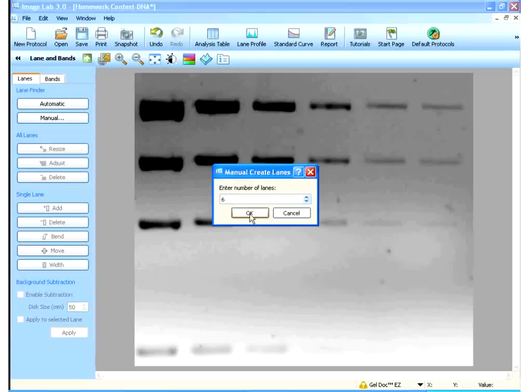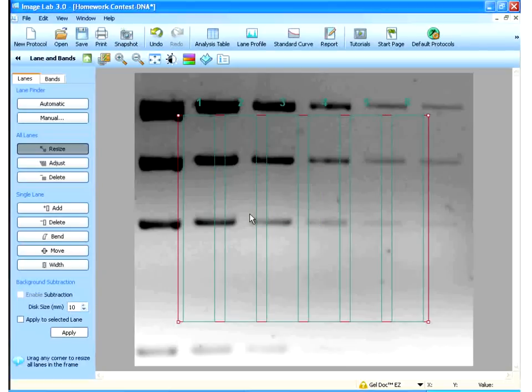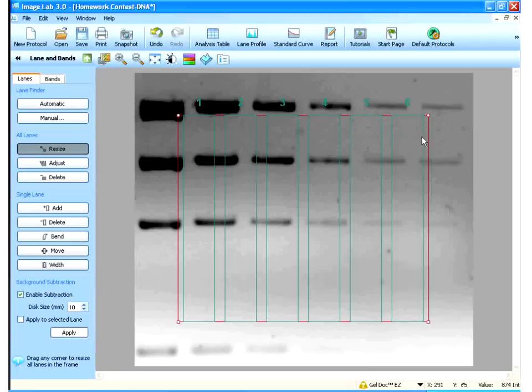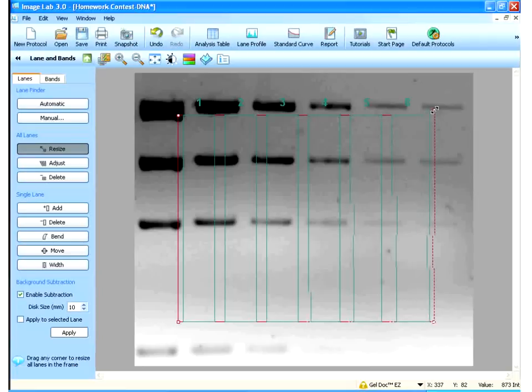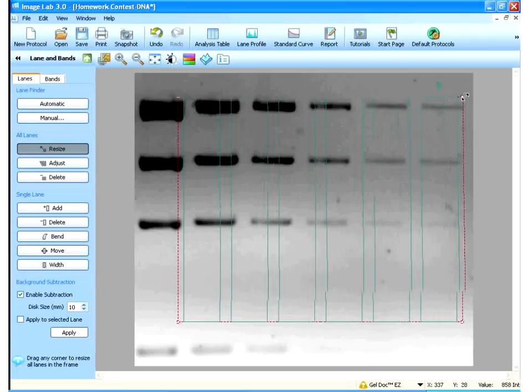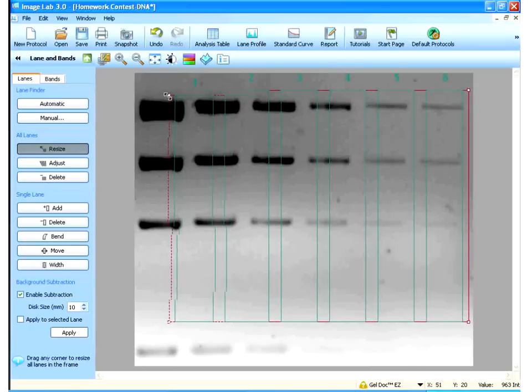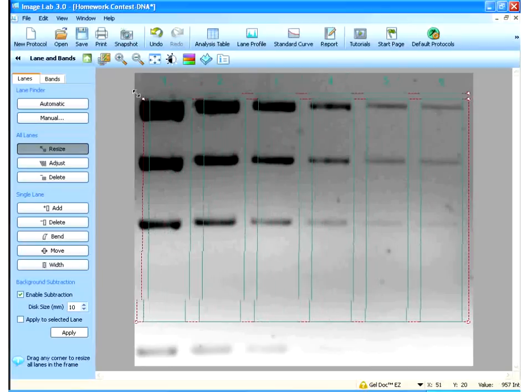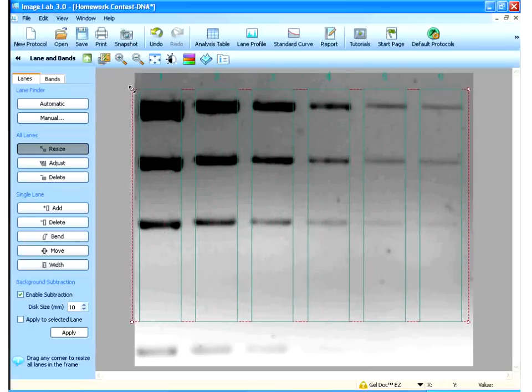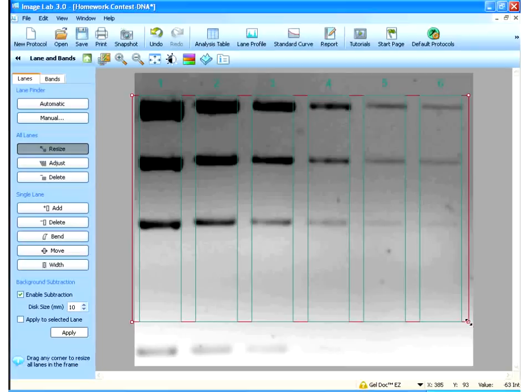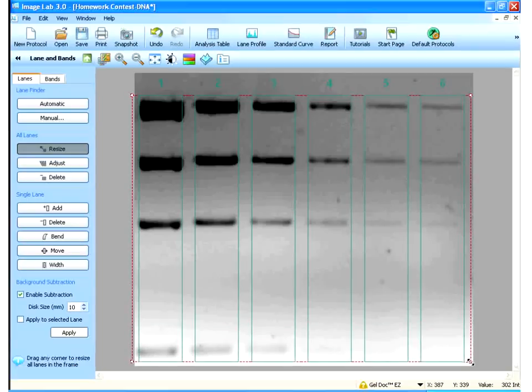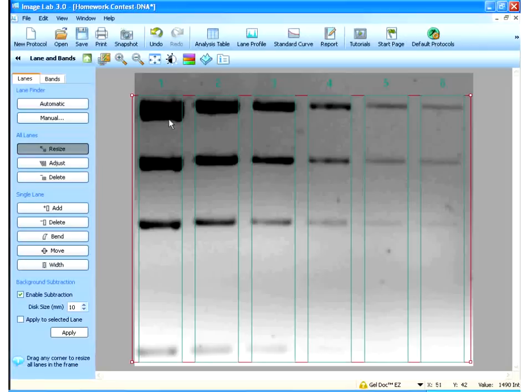So, there are six lanes in this gel. So, six. And I get these lanes that are here. So, I want my bands to fit between these green lanes. So, I'm going to stretch the lane to fit across my gel. So, you can see that my bands, especially the larger bands, are a little bit overflowing in the lane. So, what I'd like to do, and also, my gel is a little bit warped at the bottom here.